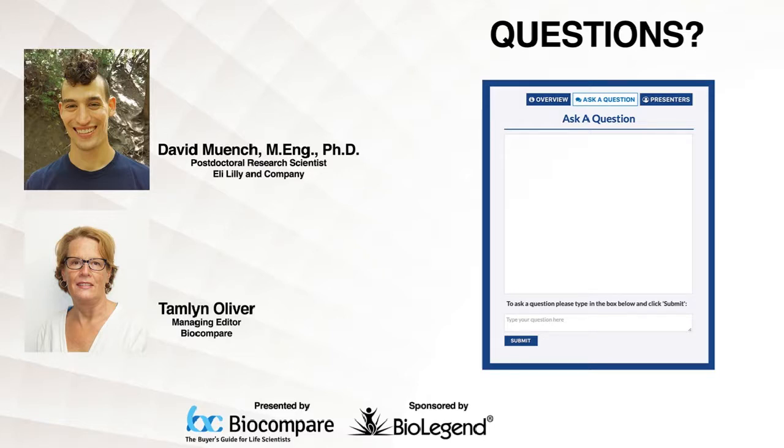Okay, thank you. Before I ask the next question, I just want to remind the audience that you can continue to submit questions. We'll have time for them if you submit them soon. All right, the next question, David, is you mentioned that there are hundreds of total-seq antibodies available. Why did you use only 10 or so? Is there a limitation on the number of antibodies that can be analyzed simultaneously?